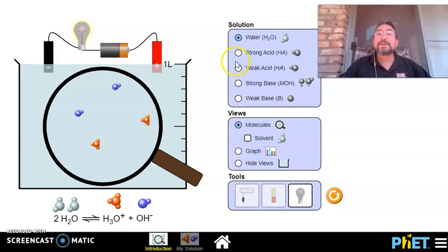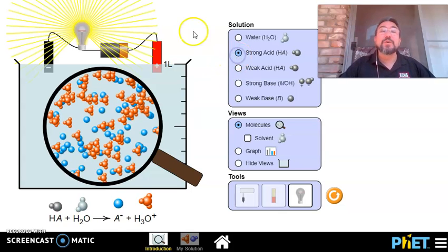What would happen if I have a strong acid? Look at that, all that light being conducted because the electricity flows through. Notice that's because a strong acid completely ionizes into the two ions.